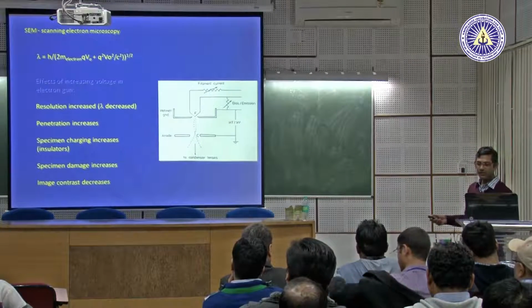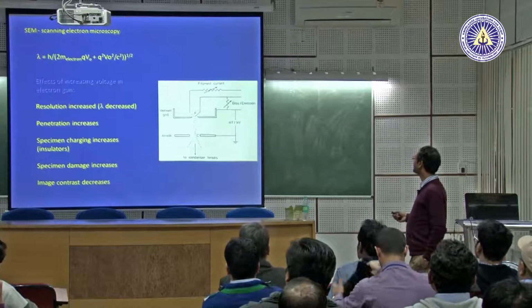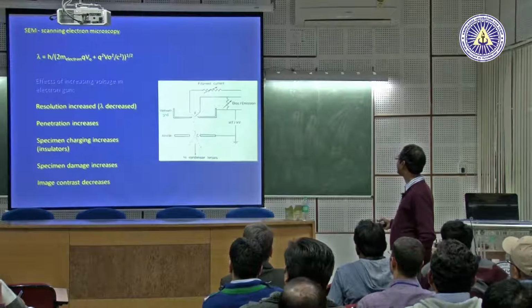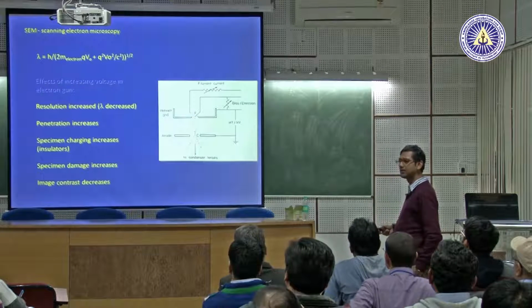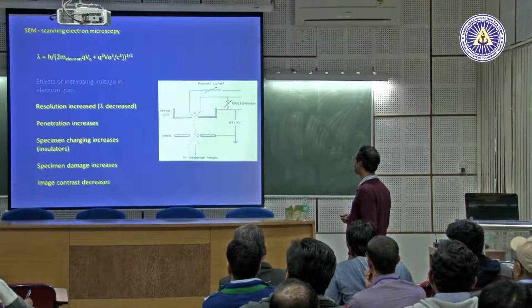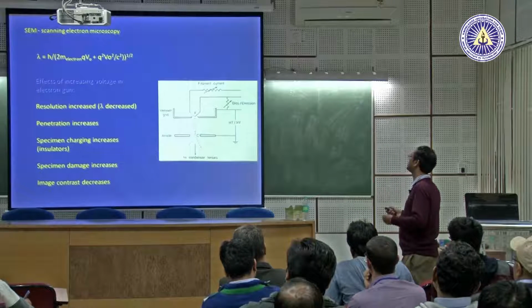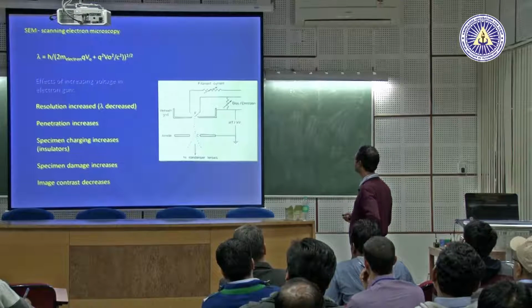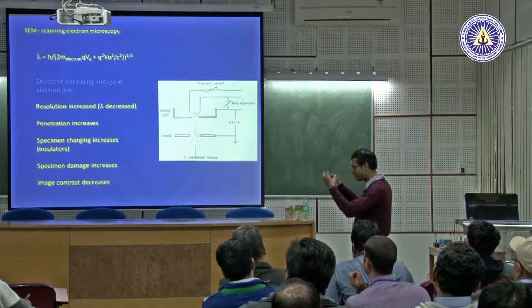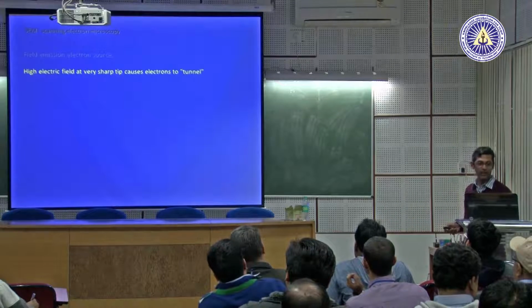Okay. So that's it. Now the electron gun, to make you understand, is just like a tungsten filament for most of the machines. You pass current through the filament, then it emits electrons because of thermionic emission, and then this can be focused by a set of lenses. This is the Wehnelt cap which allows you to condense it. Then you have a condenser to form a beam, because electrons will come from all sides and scatter, so you have to condense and focus it. This is the simplest possible thing people use, but nowadays we have gone ahead.